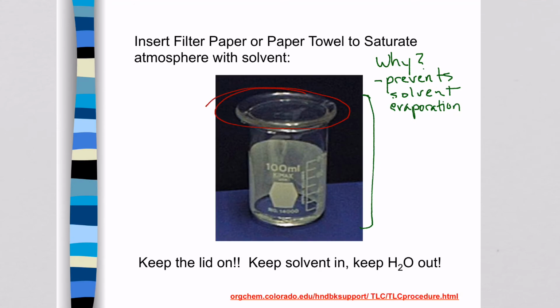One thing is it prevents solvent evaporation, and the solvent that you're going to be using as your developing solvent is ethyl acetate, and there's the condensed formula for ethyl acetate. It's also often abbreviated EtOAc. And that solvent, as you might recall from the MIT video, is a bit polar, and so this is a solvent that works very, very well for this particular separation.